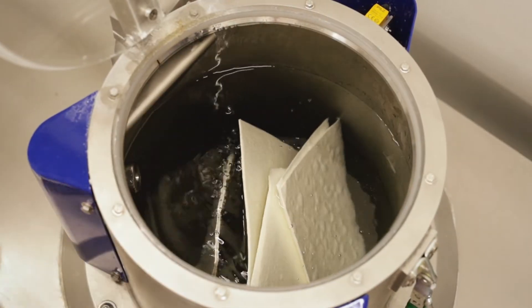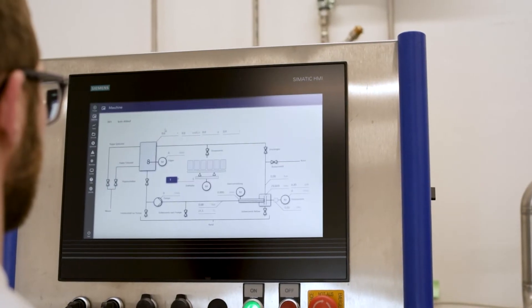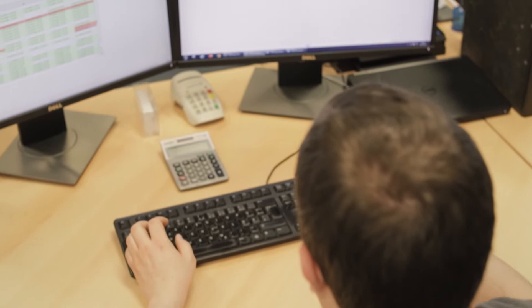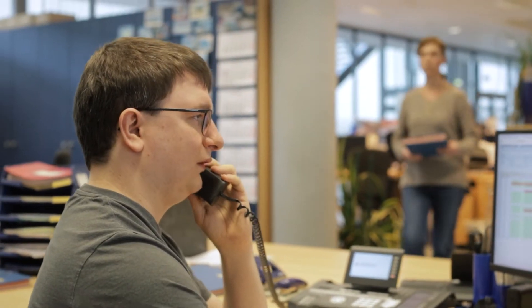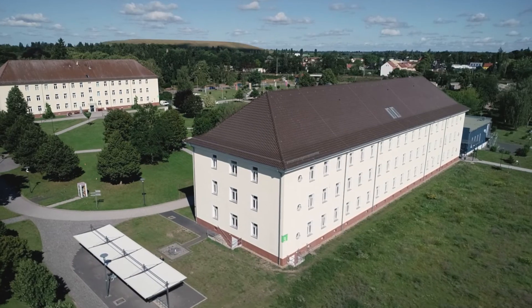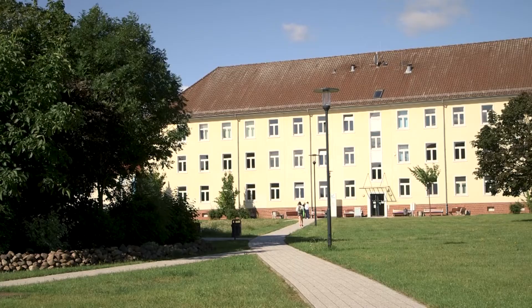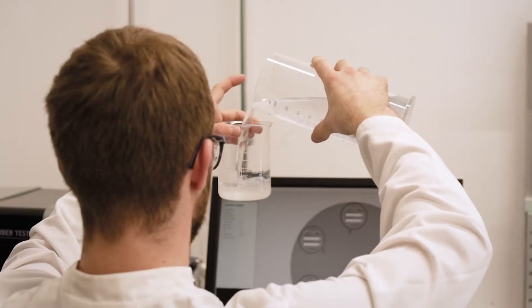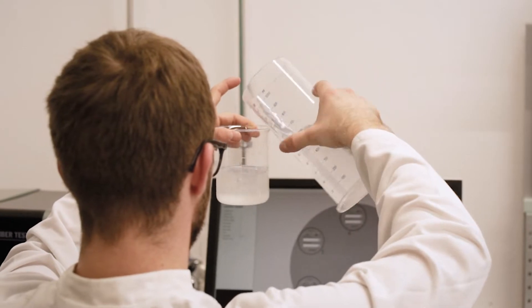At its core is a fully automated laboratory refiner. Our research and trial activities focus on projects with customers. We work closely with universities and research institutes while supporting our mills and quality control.